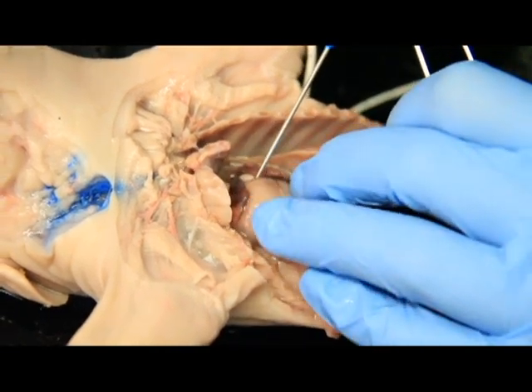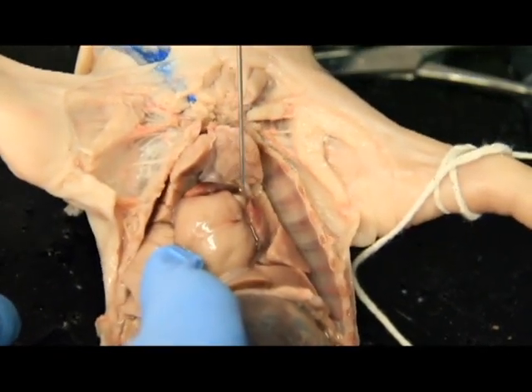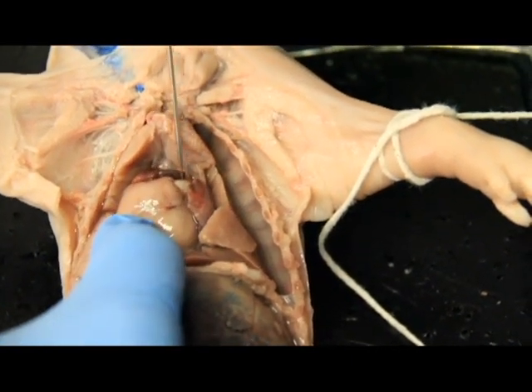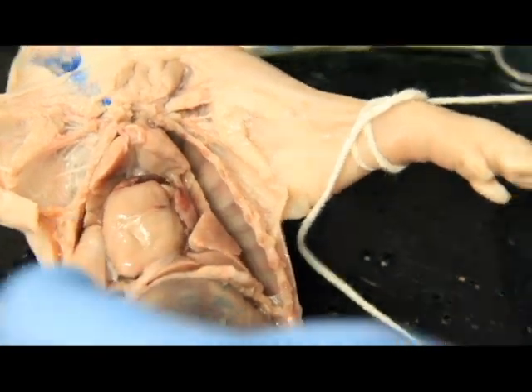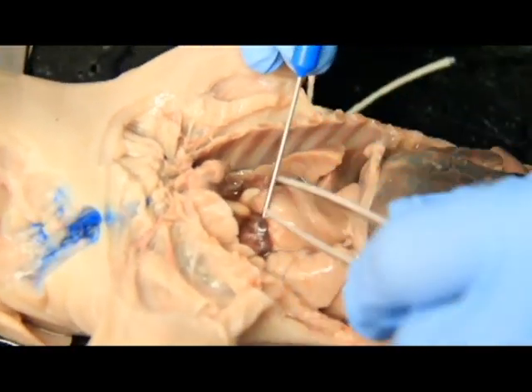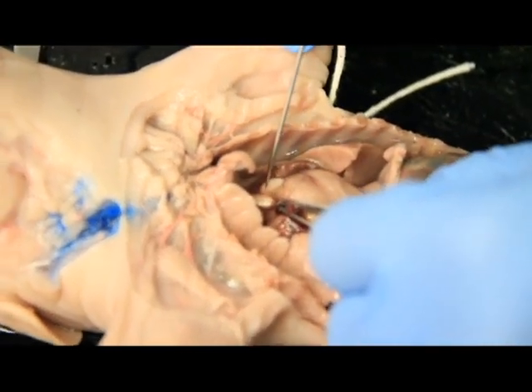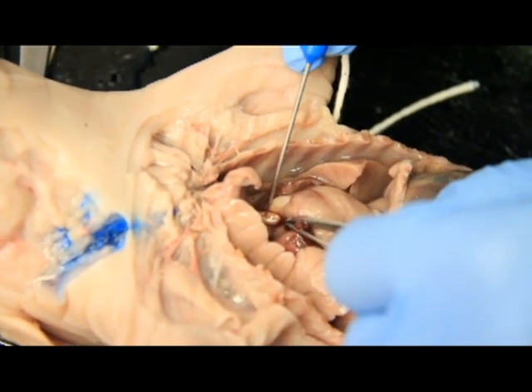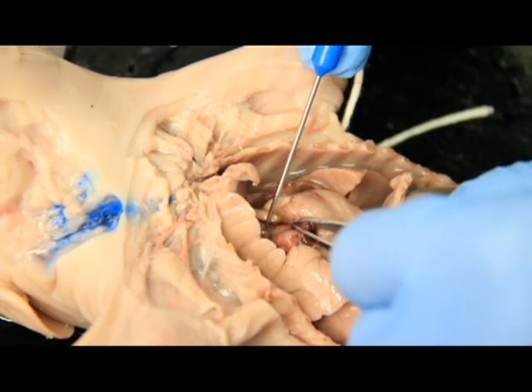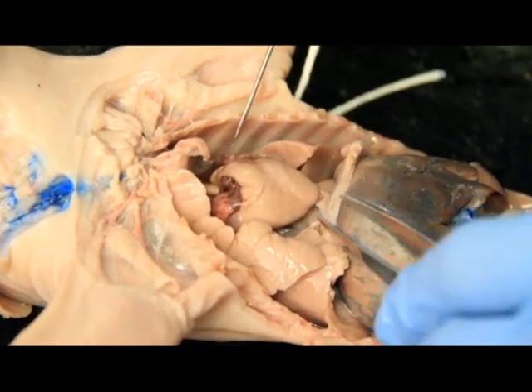You can also notice this big white thing coming out here on the right hand side, the pig's left hand side. This is your pulmonary artery. That's where the deoxygenated blood is coming from the heart and going to the lungs. That pulmonary artery is this big white one right here. And then if we pull the heart down, and behind these auricles, you can see this giant white thing right here. If we were to actually cut this membrane and separate the pulmonary artery from this, you'd see that arch. This big white one is our aorta. Right next to it is the big blue one, that's your vena cava. This is the aorta, this is the vena cava, pulmonary artery, auricle, heart.